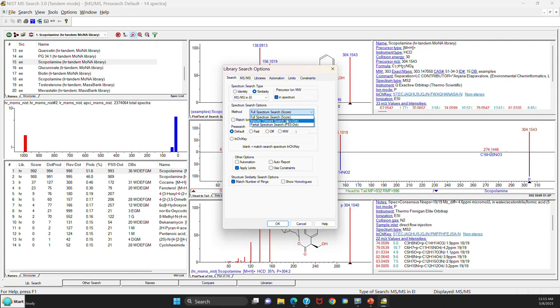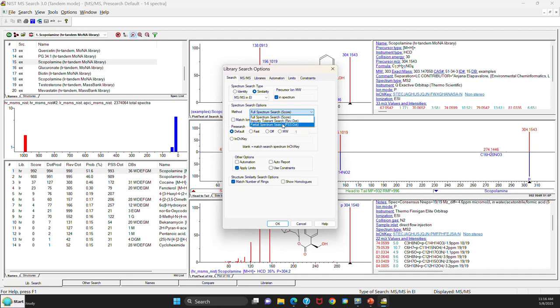If you look at the full spectrum search, that's much like a standard search. The impurity tolerant was what it would be called before would be the reverse search. And that does not penalize you if there are extra ions in your spectrum of the unknown as compared to the library spectrum, so it doesn't affect the score.